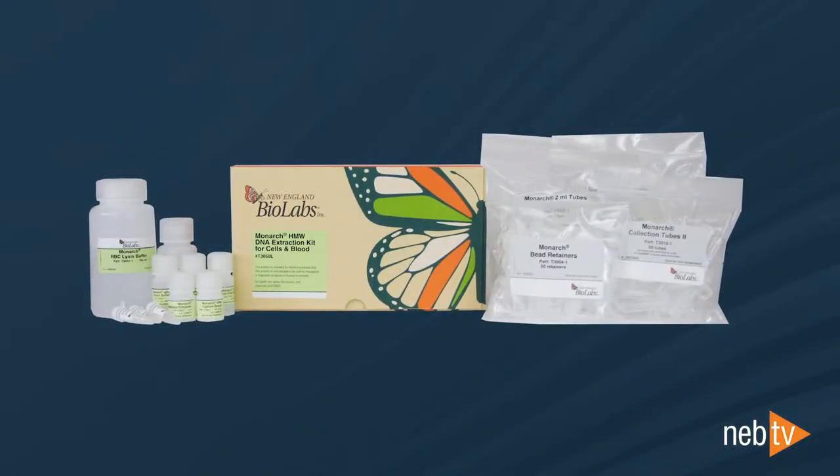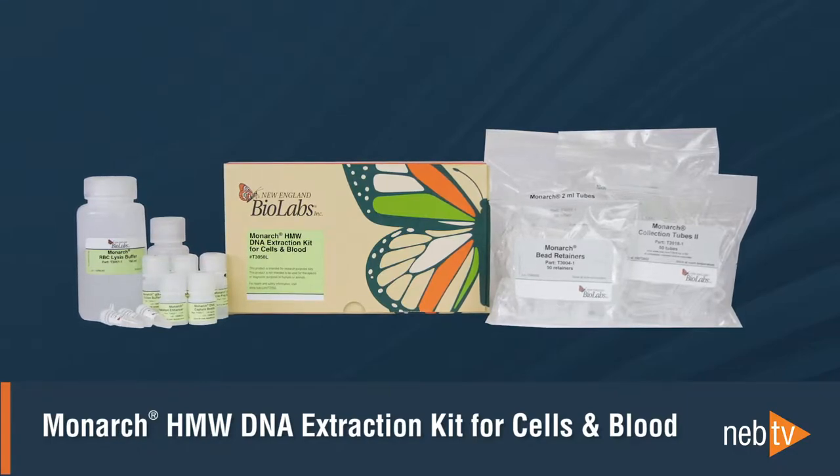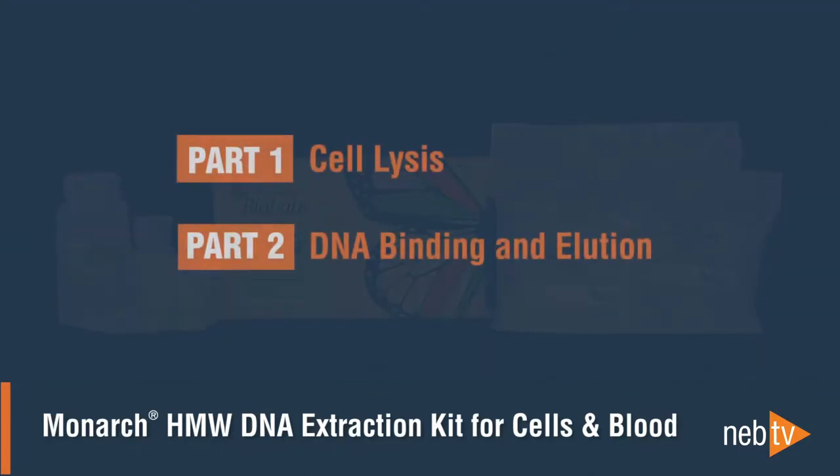In this video, we are going to walk you through the workflow for high molecular weight DNA extraction from cells using the Monarch high molecular weight DNA extraction kit for cells and blood. The protocol is broken into two parts: cell lysis and DNA binding and elution.